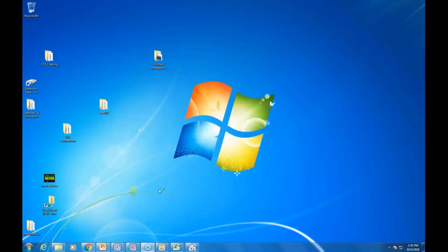So once it's done assembling, because I ran this through an RNA-seq experiment, there will be an ArrayStar project ready to go. I don't have to use the custom data import wizard. So it'll be in ArrayStar already. There'll be a .astar project that I can download then. And those are relatively small, so I can just download that project and start my analysis.